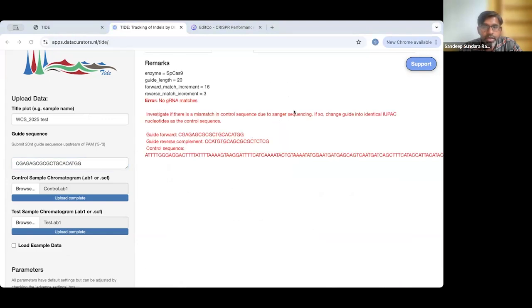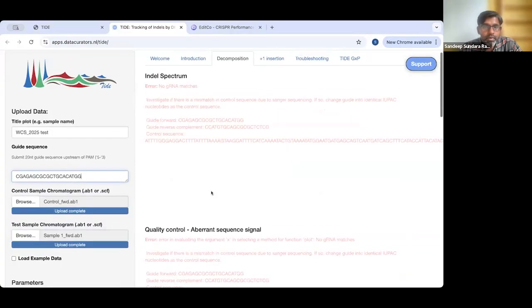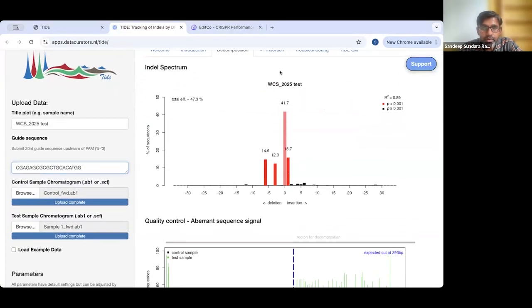And I'm just adding my trace files as well again. Okay, so you've got your results back again. I'm going to stop sharing my screen and just work on showing you an example on my desktop actually.